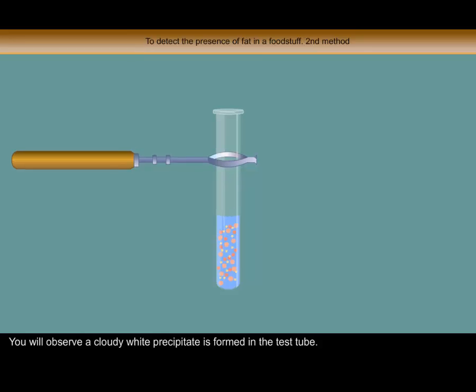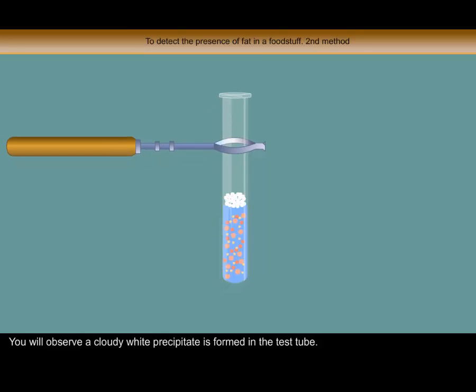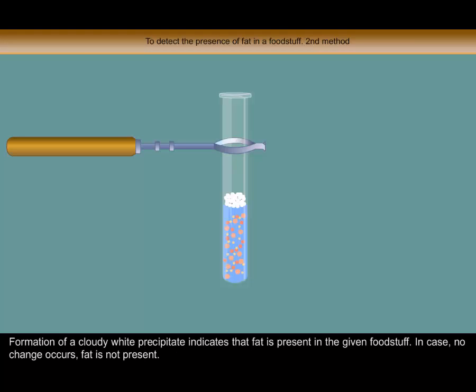You will observe a cloudy white precipitate is formed in the test tube. Formation of a cloudy white precipitate indicates that fat is present in the given foodstuff.